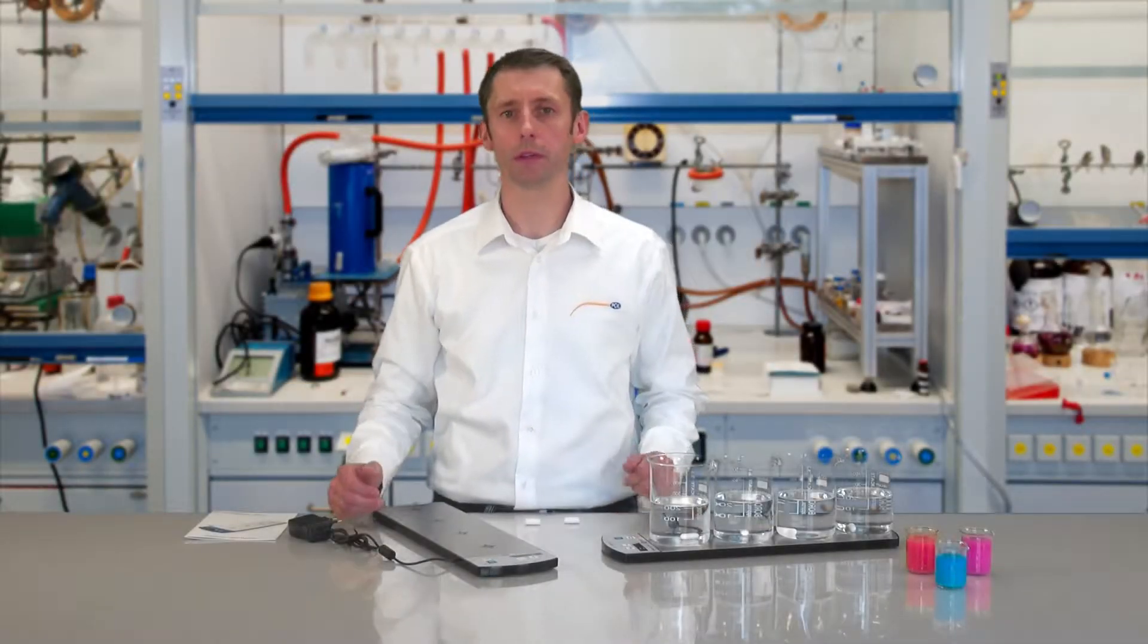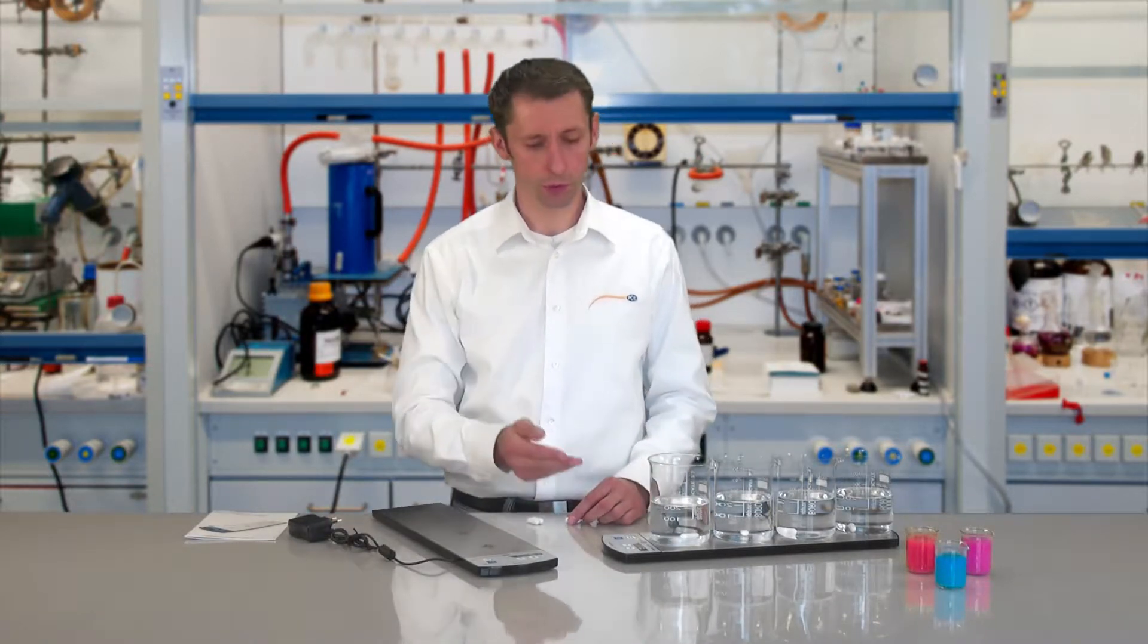A very warm welcome to PC Instruments. My name is Lukas Ludwig and today I would like to present to you the Magnet Stirrer PC-MSR400.